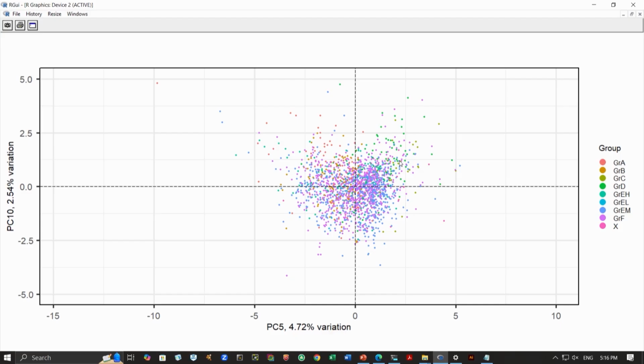So what we saw is that purple and blue were separated out by PC1. So what we want to do is look at the loadings of PC1, what are the features that are loading the PC1, the top 1% or 2%, and these are the features that will be able to explain the difference between our purple and blue cluster.